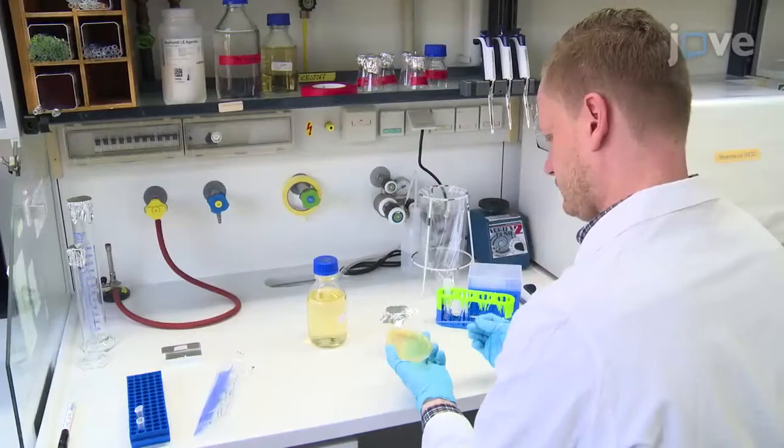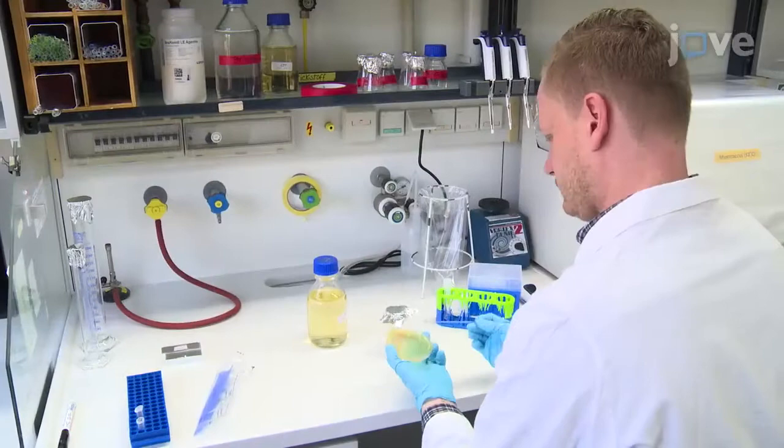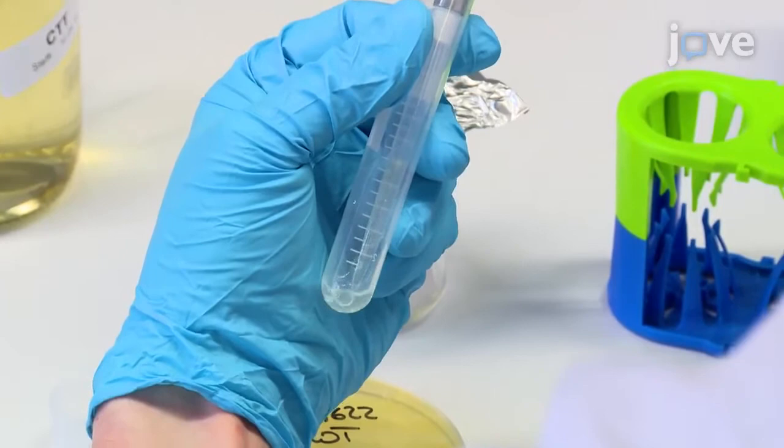To begin, re-suspend a single M. xanthus colony in 500 microliters of 1% CTT supplemented with antibiotics in a sterile tube and transfer the entire suspension to a 50 mL Erlenmeyer flask containing 5 mL of 1% CTT.